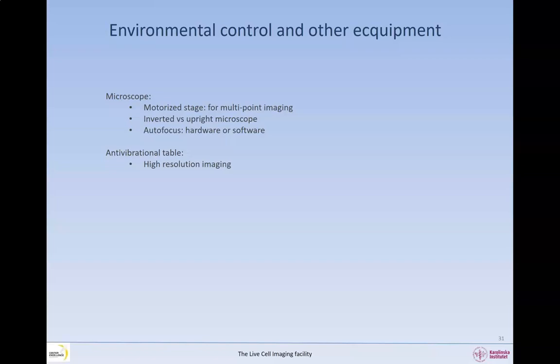When imaging, the choice of the sample carrier is of utmost importance. Nowadays, you can find imaging chambers for almost any kind of assay you might want to perform.